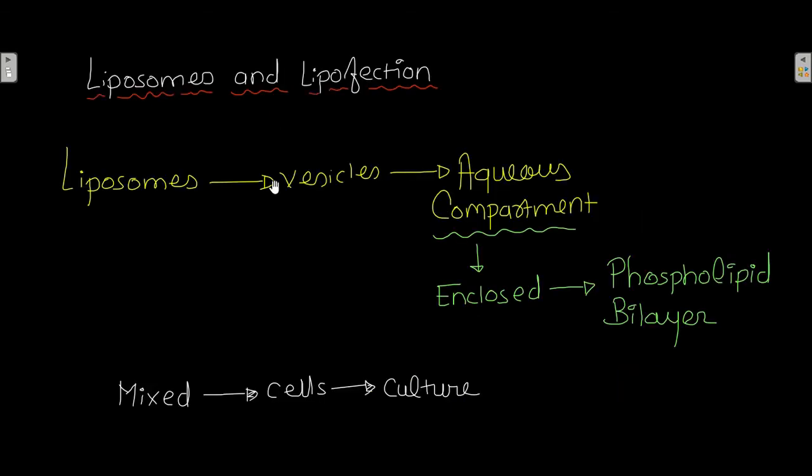Now let's discuss liposomes and lipofection. Liposomes are vesicles that have an aqueous compartment enclosed by a phospholipid bilayer.